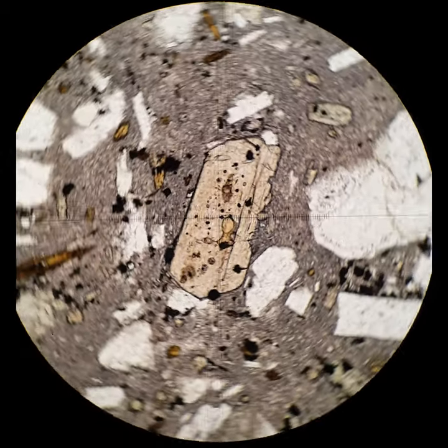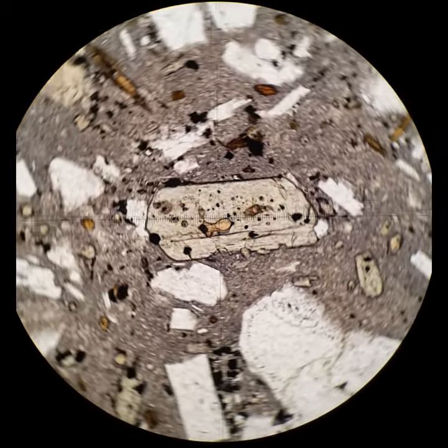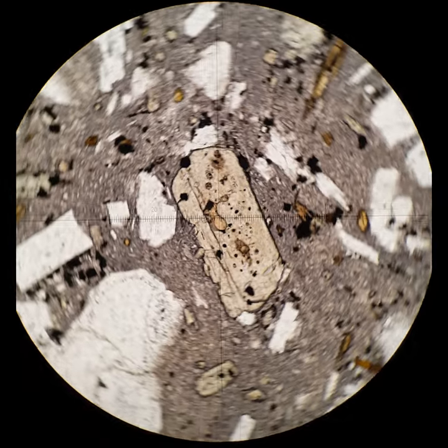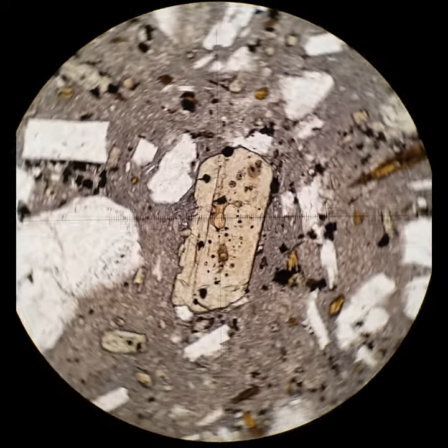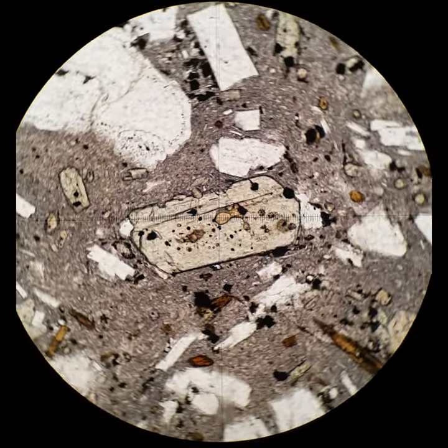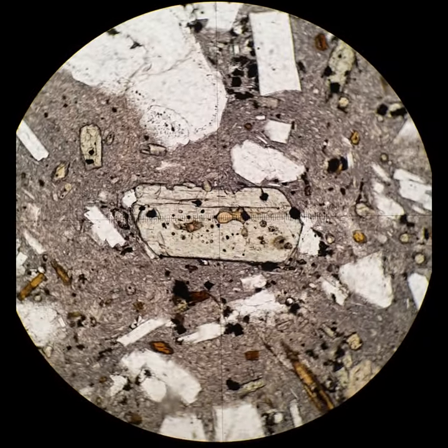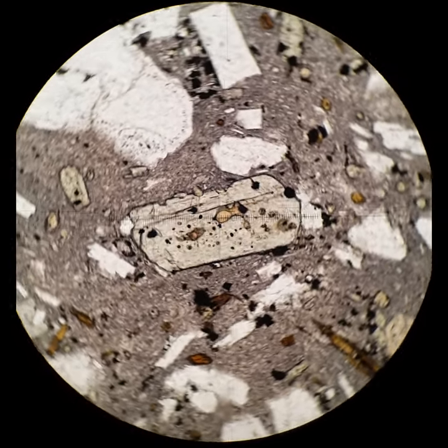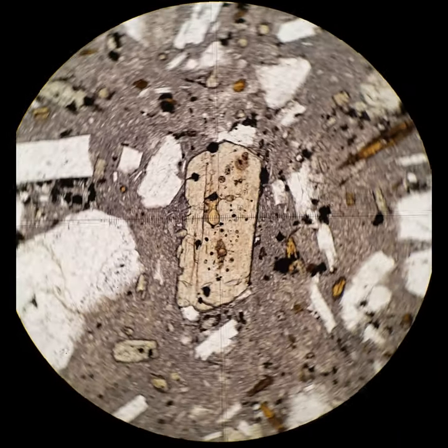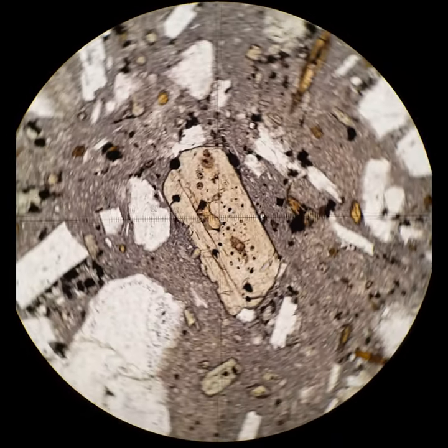This kind of pink-green pleochroism is important for identifying orthopyroxene. Here it is more or less green when it runs east-west, and pink when it runs north-south.